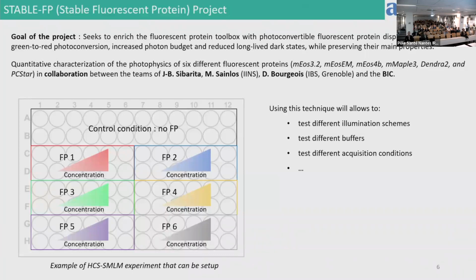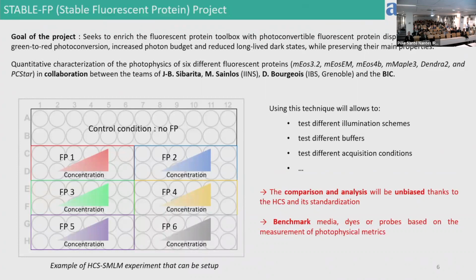And the advantage of this platform is that the comparison and the analysis will be unbiased, since the technique, HCS, brings the standardization. So all the wells are acquired in the same manner. And this will be used to benchmark media, dyes, or probes by using the photophysical metrics we have.